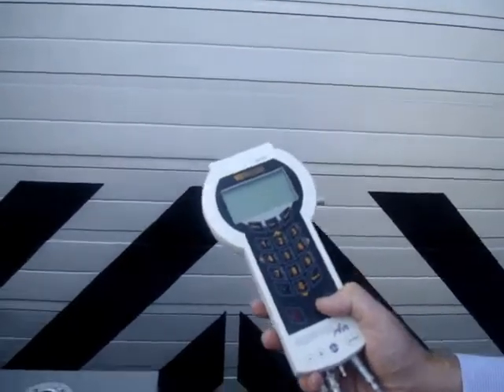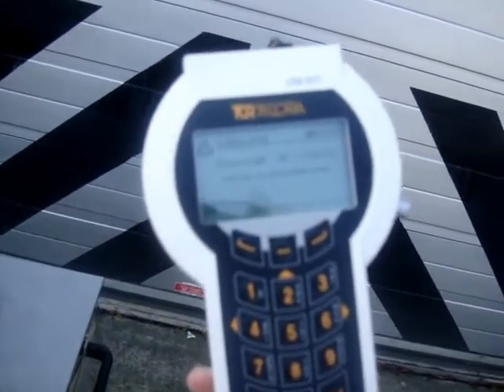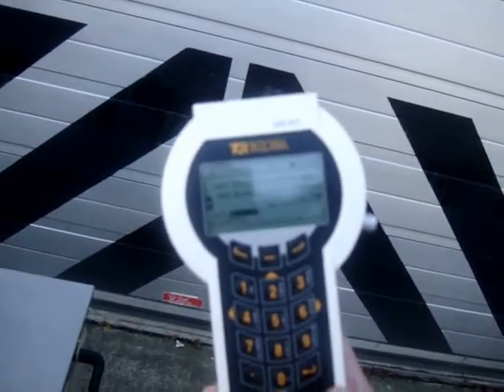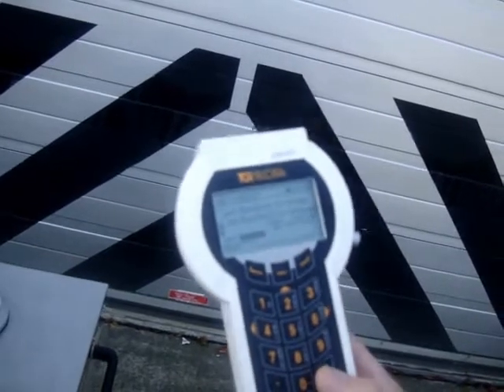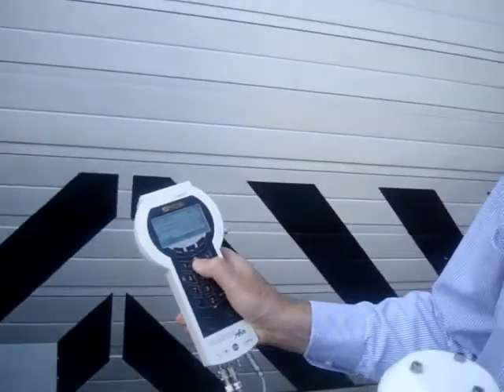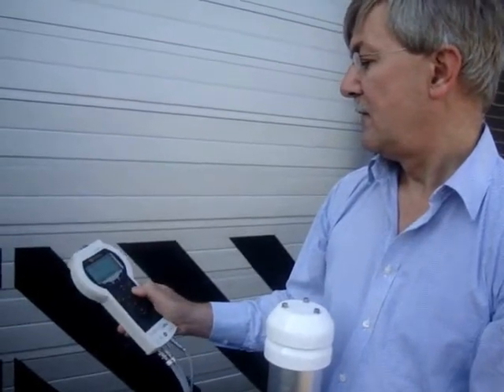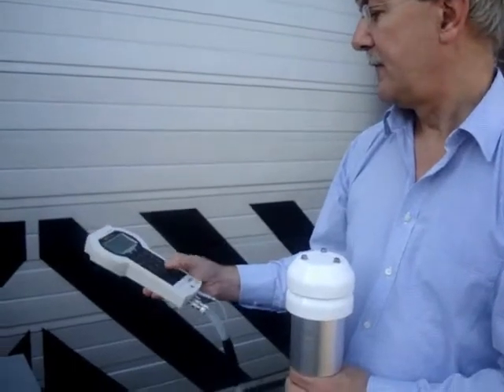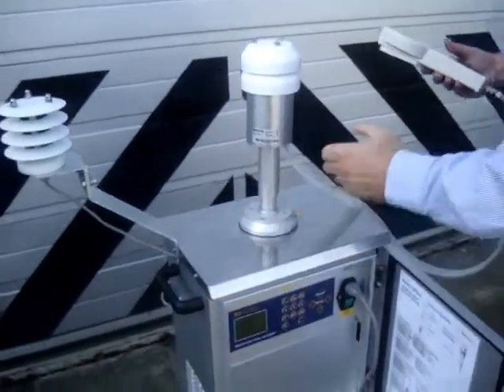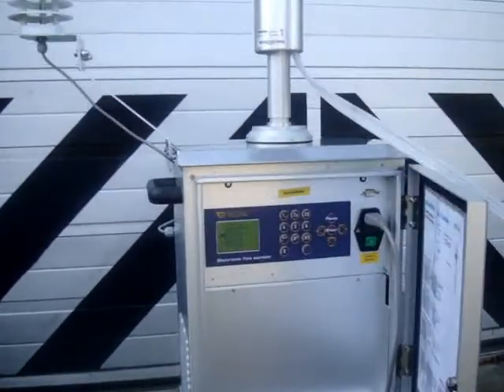Control of the device is through a handheld display. When you first turn the device on, it identifies the sensor that's connected to it. The first stage is to calibrate the zero point of the sensor. Then enter the name of the device under test, fit the flow cell in place of the sample head, and start the flow test sequence on the device.